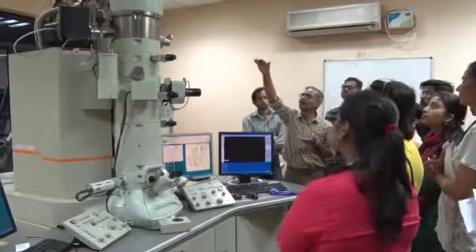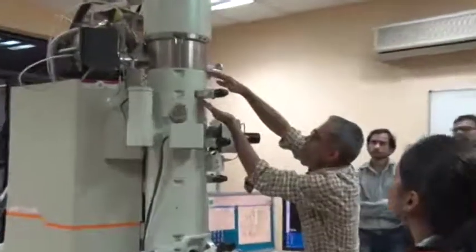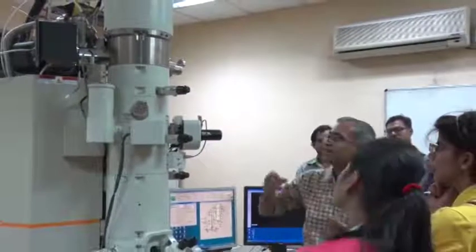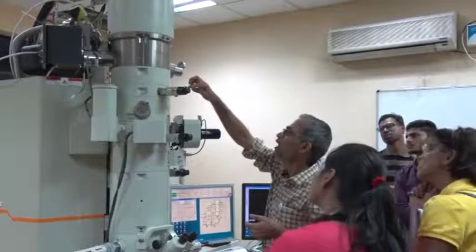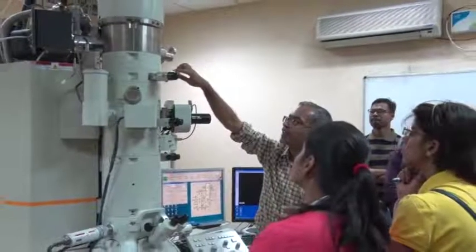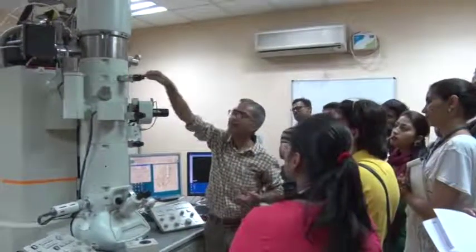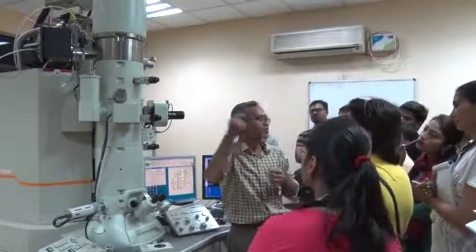Okay. So after that we have the condenser lens part. The condenser lens part is this much here, and this is the condenser aperture. It is possible to insert apertures of different sizes. For example, now the largest condenser aperture is inserted. This is understood by the size of this, and it has to be aligned. If I want to completely take out the condenser aperture, then I turn it like this. This indicates it is completely out. There is a notch system kind of thing.